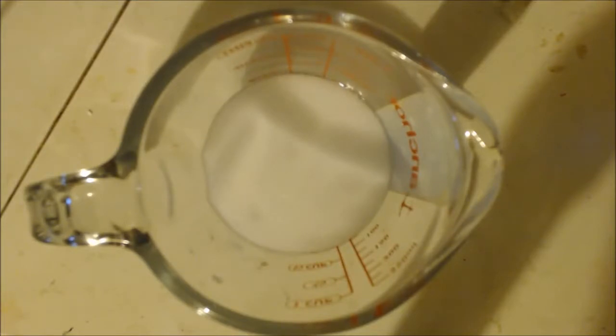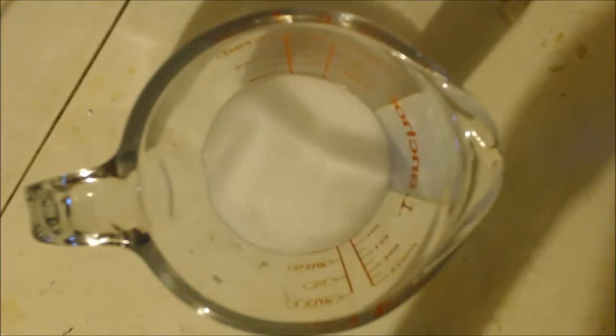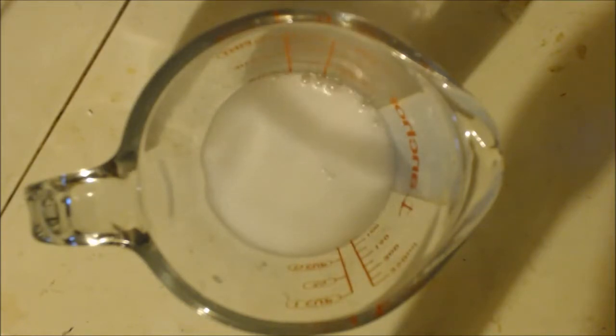I'm definitely getting fizzing — there's a nice reaction, that's a good sign. Like an idiot, I should have another container like a plate or dish that can hold it when it overflows, but I don't.